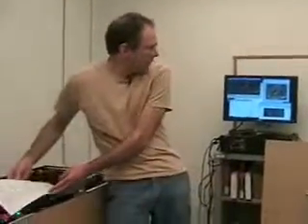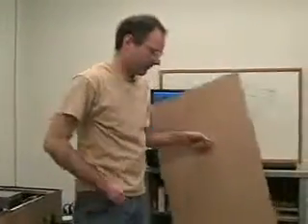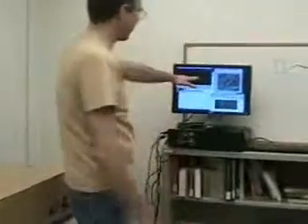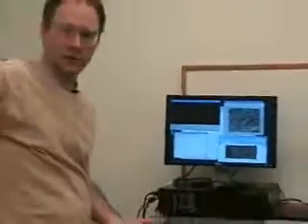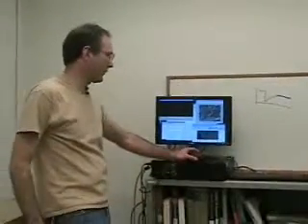You can actually see, if I just take a piece of paper and put it over, that the whole image gets darker. I'm just blocking some room light from getting into the lenses. So clearly there's a lot of room light getting in there. The best way to solve this problem is to take the top and put that on the box. At that point you'll see suddenly the whole image becomes much darker. What that tells you is that a lot of what we were seeing was not due to the lamp in the box, but just due to ambient light in the room, the room light, sunlight coming in the window.